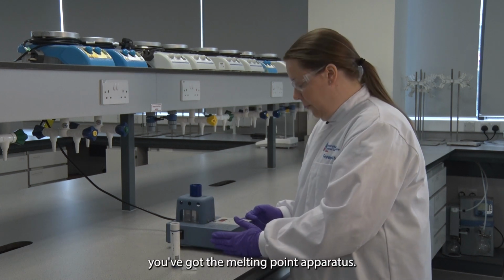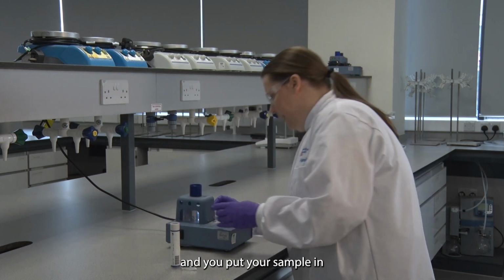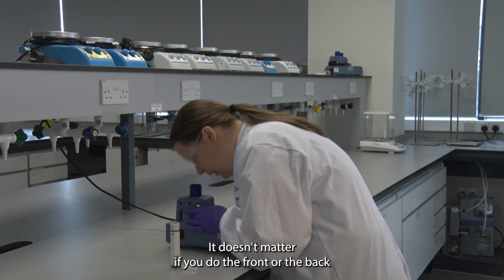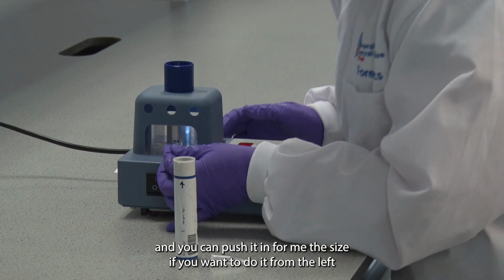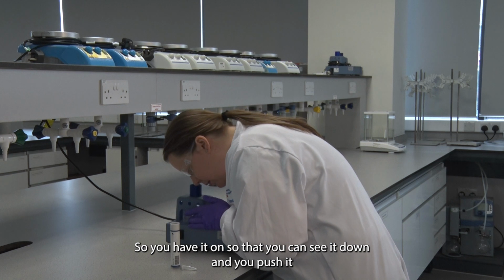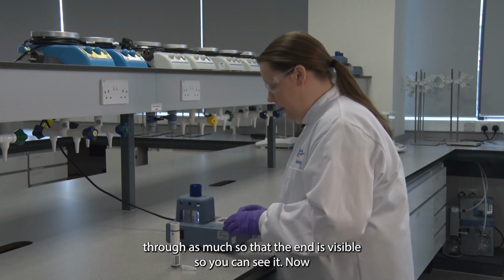You've got the melting point apparatus. It turns on at the side and you put your sample in. So there's two holes that you can slide it in. It doesn't matter if you do the front or the back, and you can push it in from either side. So if you want to do it from the left hand side or the right hand side. So you have it on so that you can see it down, and you push it through as much so that the end is visible so you can see it.